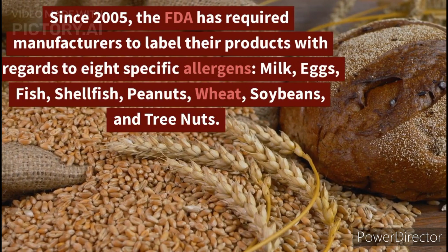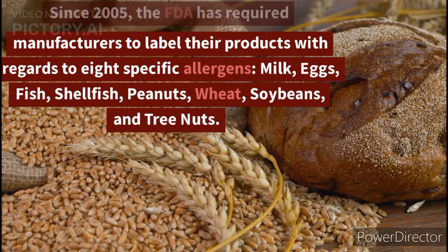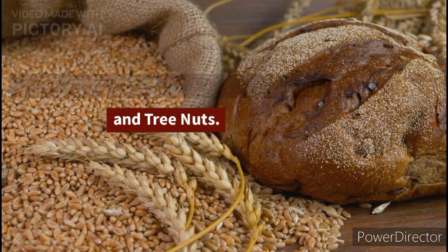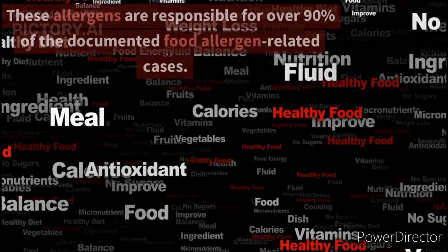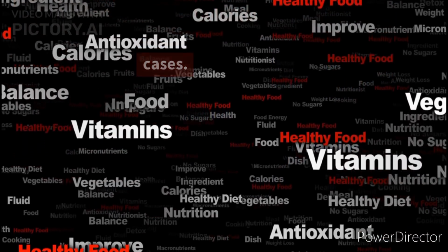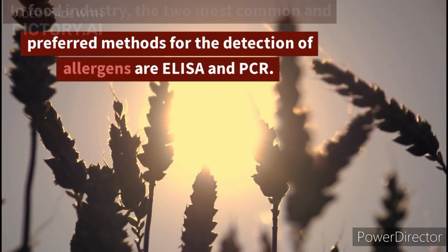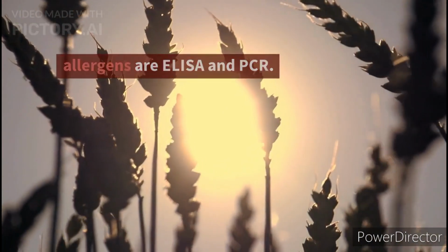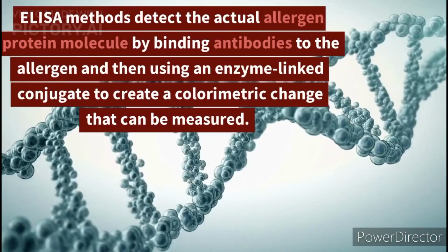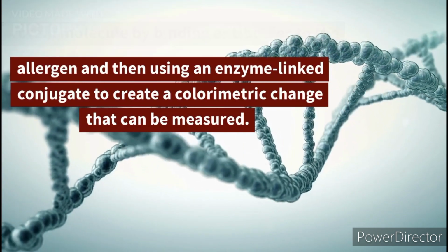Since 2005, the FDA has required manufacturers to label their products with regards to 8 specific allergens: milk, eggs, fish, shellfish, peanuts, wheat, soybeans, and tree nuts. These allergens are responsible for over 90% of the documented food allergen-related cases. In the food industry, the 2 most common and preferred methods for the detection of allergens are ELISA and PCR. ELISA methods detect the actual allergen protein molecule by binding antibodies to the allergen and then using an enzyme-linked conjugate to create a colorimetric change that can be measured.